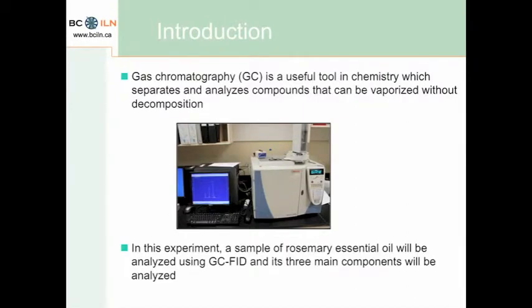This experiment will utilize GC to separate the components in rosemary essential oil and then analyze them by flame ionization detection, also known as FID. Its three main components will be determined.